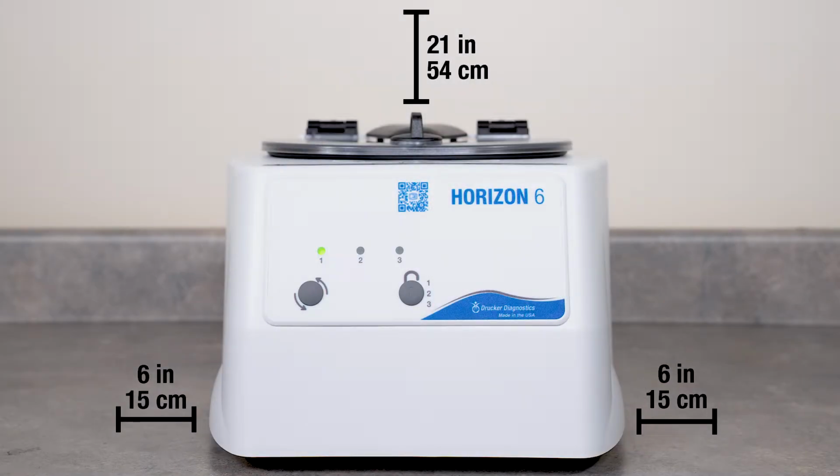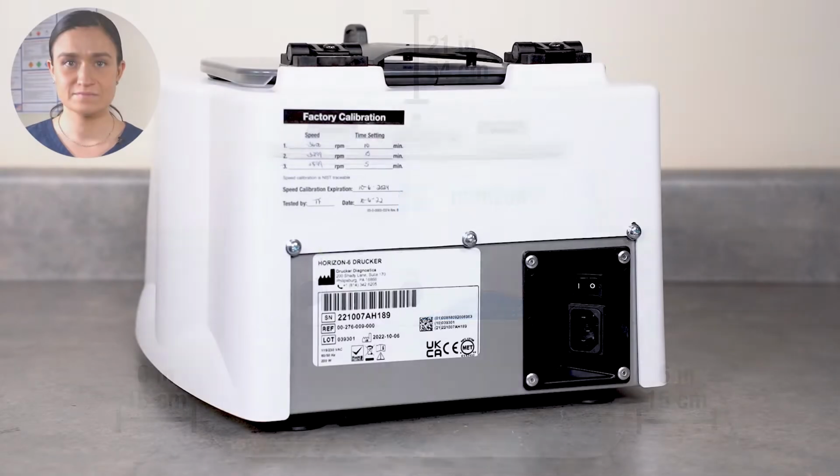Start by placing the centrifuge on a flat, level, sturdy surface. Leave at least 6 inches, 15 centimeters, of space on all sides, and at least 21 inches, or 54 centimeters, of height above the lid so you can easily open it.